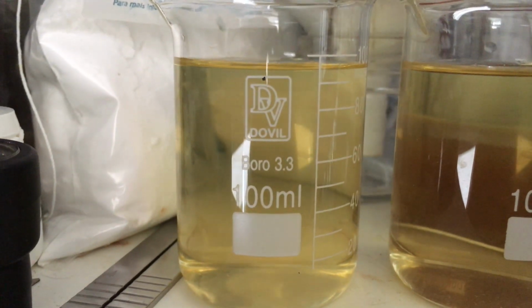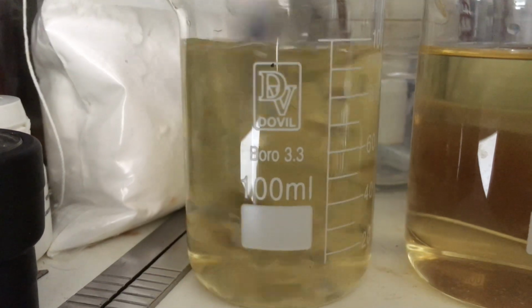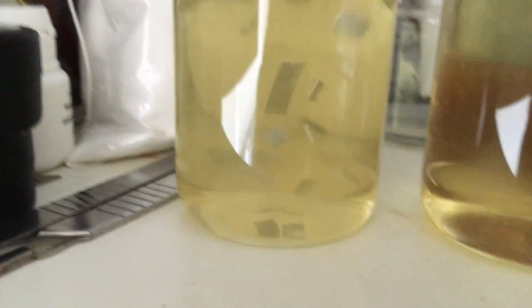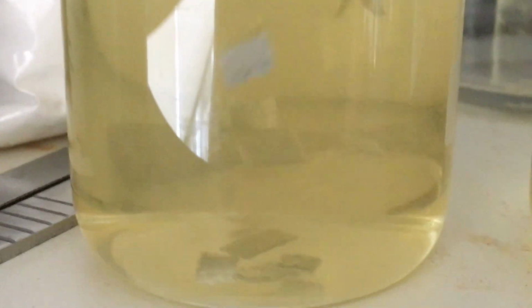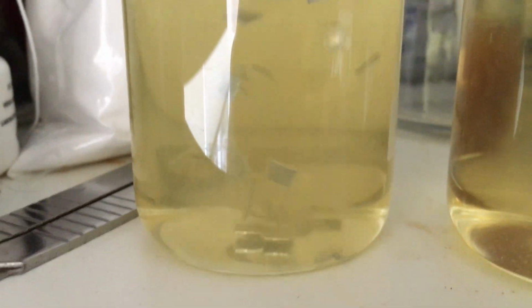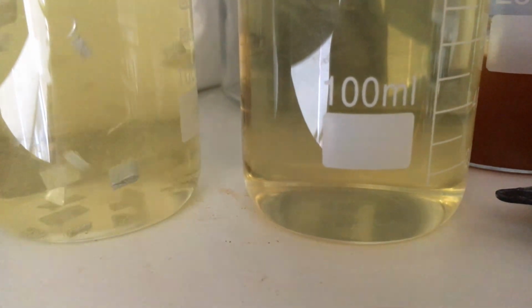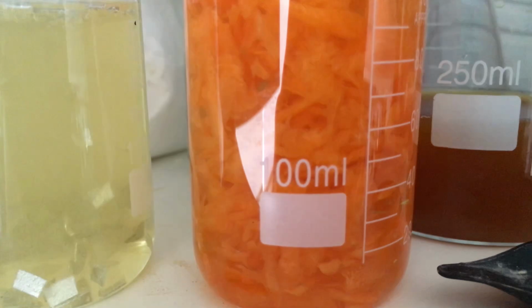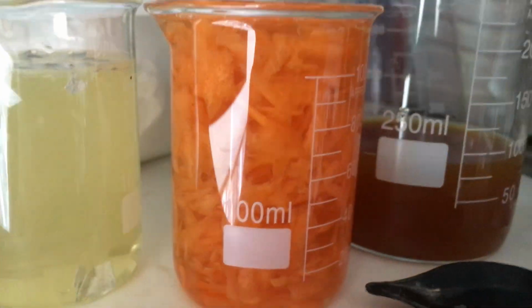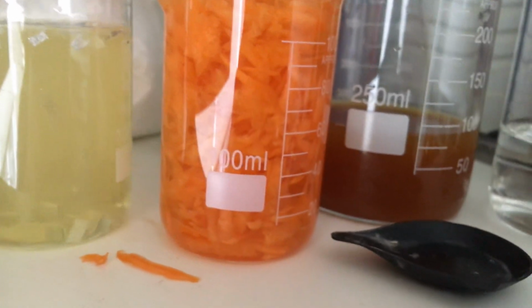So here is the magnesium shavings. It should form some bubbles, which it has. It's fizzing and it's releasing hydrogen and reducing the harmaline. And then now I'll be putting the carrot shavings in. In the meantime, I'll be leaving this for 2 days, so that it has more opportunity to perform.